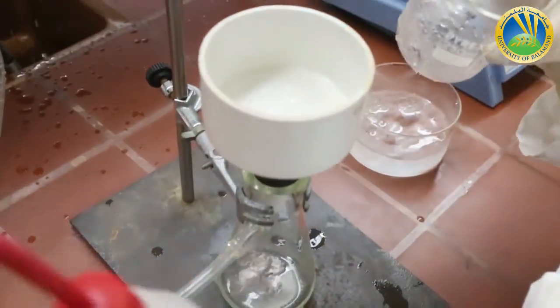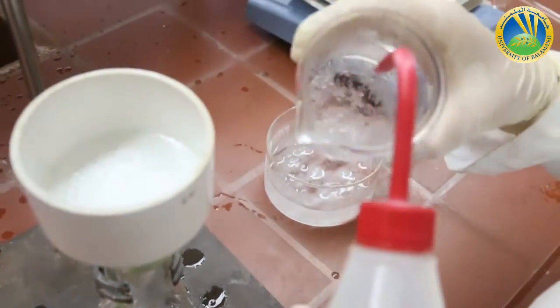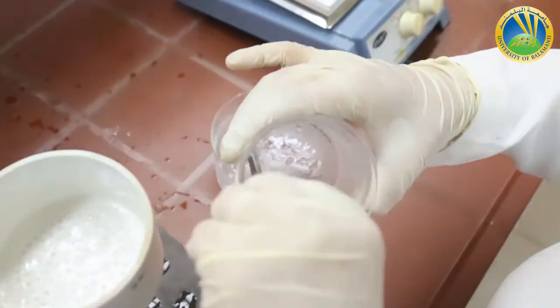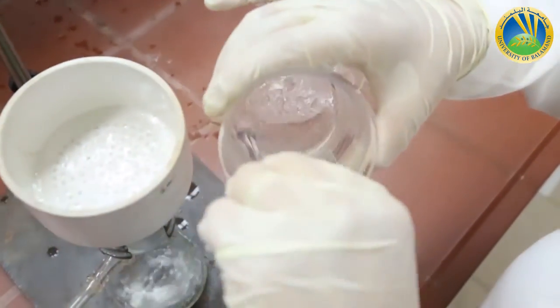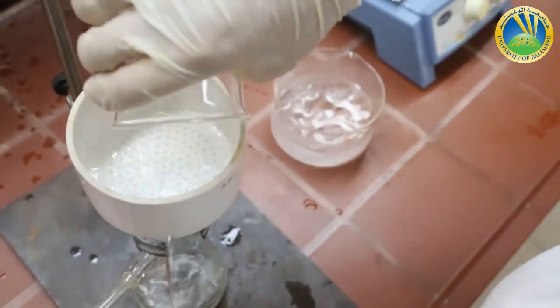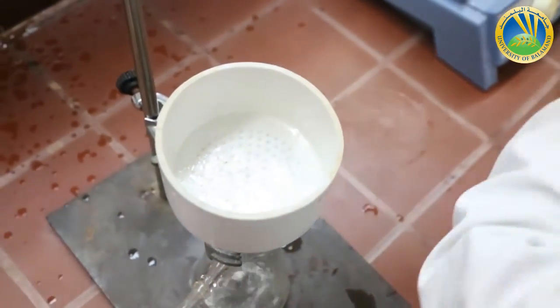I can use little cold water. And now all my crystals are collected on the filter paper.